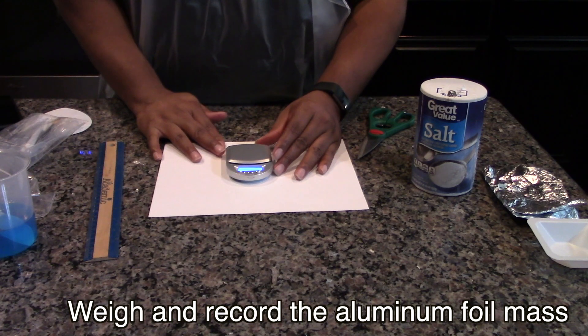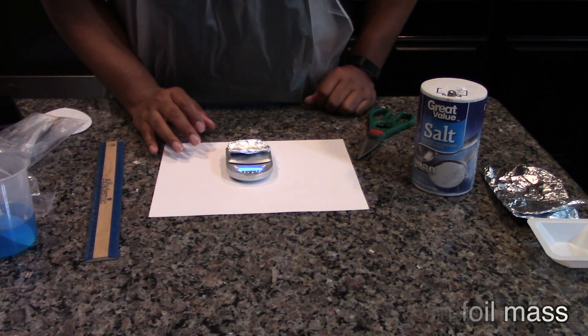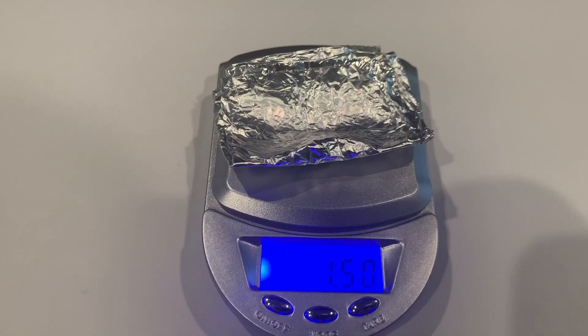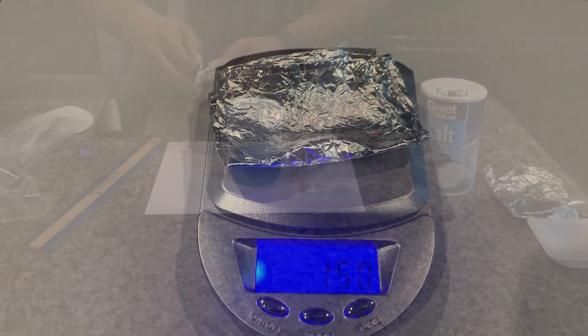Weigh and record the aluminum foil mass in the data table. For best results, use between 1.4 and 1.6 grams of aluminum foil.